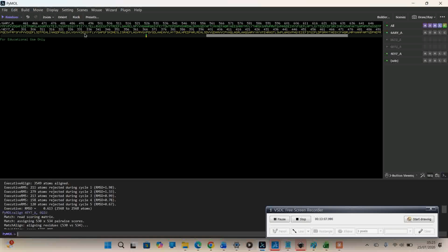So the matching here will be... so you can already check. No, it's not. We didn't get that one this time. Take this one off. That should be tyrosine. Yeah, so it's matching.